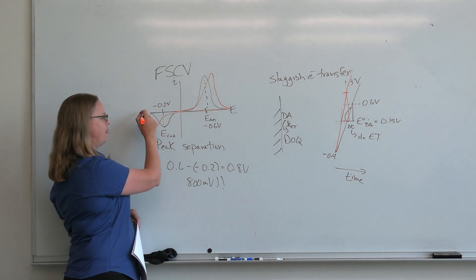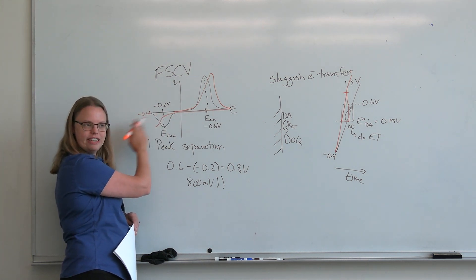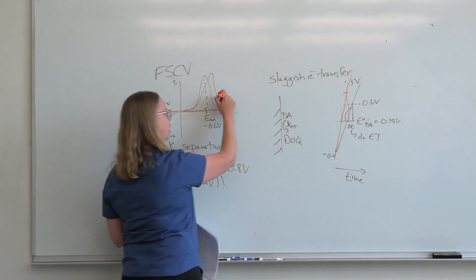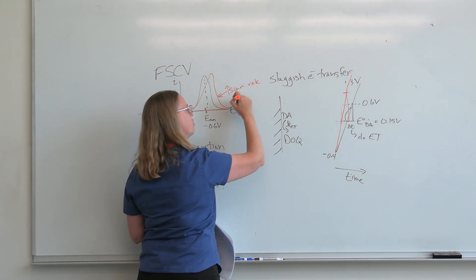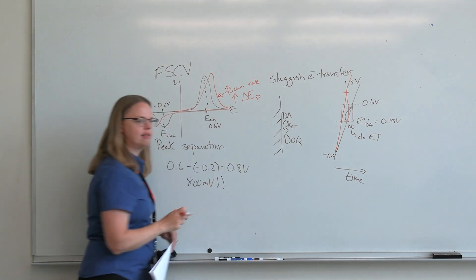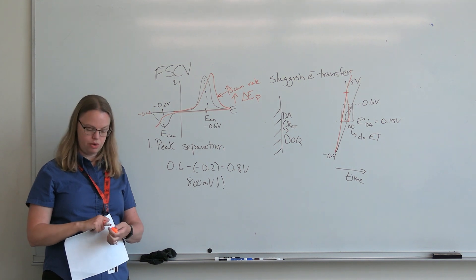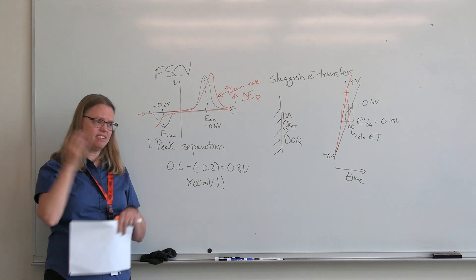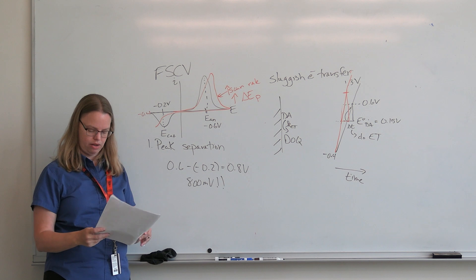If I'm only scanning down to minus 0.4V, that means the peak is actually not even being fully captured — I can't see it. So peaks shift with scan rate: a higher scan rate gives you a higher delta E peak. That's one of the reasons we don't go at screaming fast scan rates — all the peaks shift out, and it's hard to fit them within our given potential range.